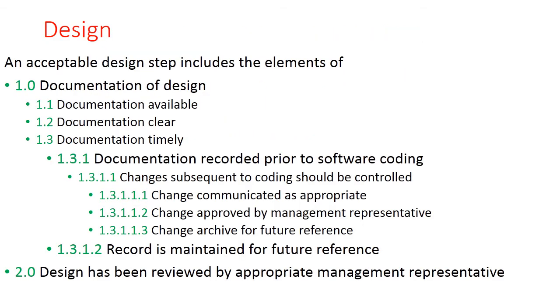Next is about design. An acceptable design step includes the elements of, and this particular part would remain the same in every guideline, documentation design, documentation available, documentation clear, and documentation timely available. Documentation recorded prior to software coding. So changes subsequent to coding should be controlled.